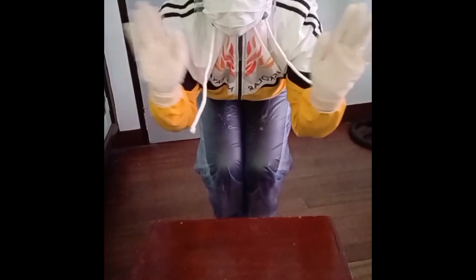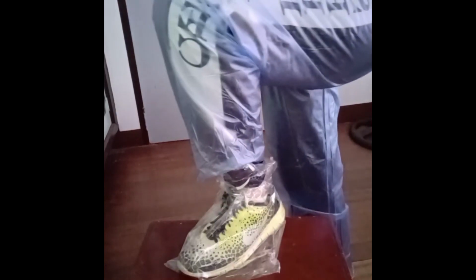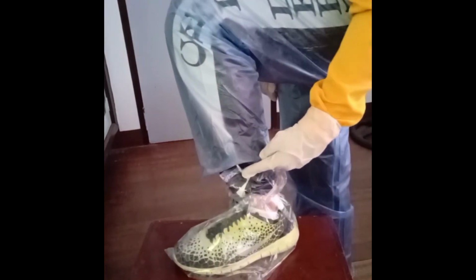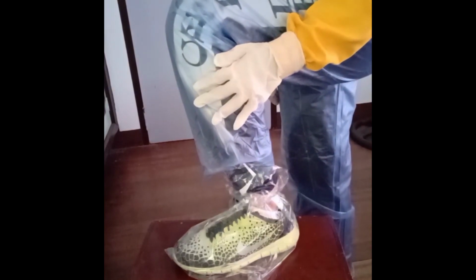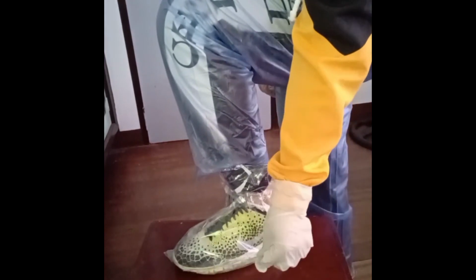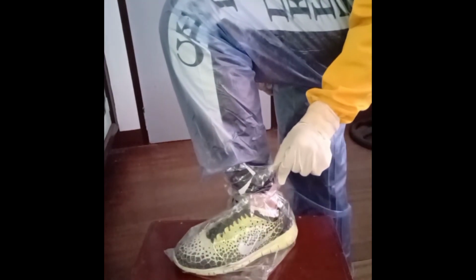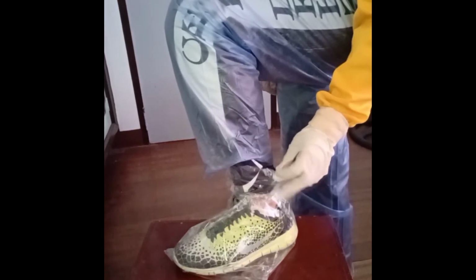Next is the protective equipment used for the feet. The feet are also important to be protected during laboratory works since they also have the capability of spreading microorganisms in public areas when not properly covered in the lab. Polyethylene is commonly used for laboratory grade shoe covers. Because of this, we may be able to use common plastics as substitute.